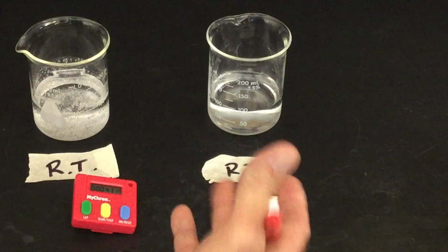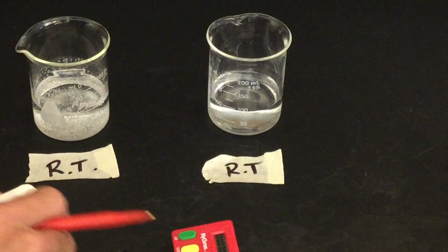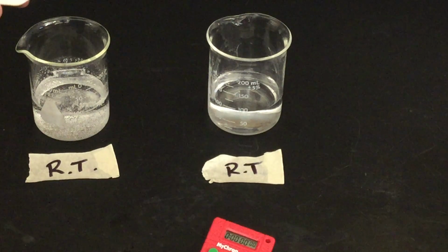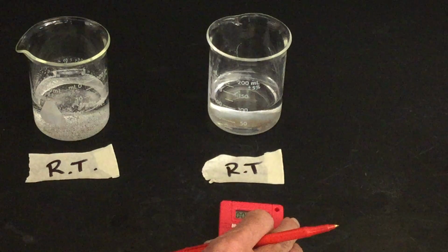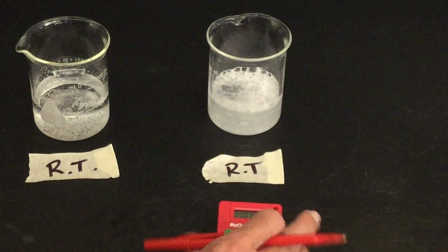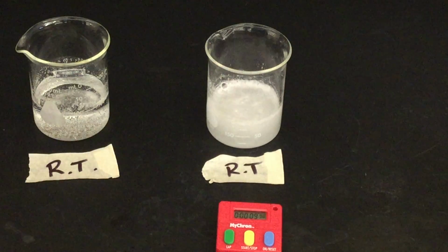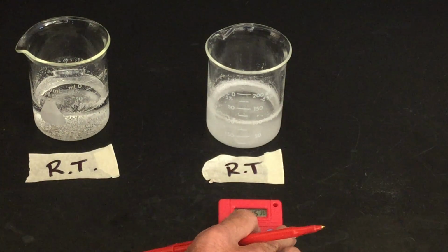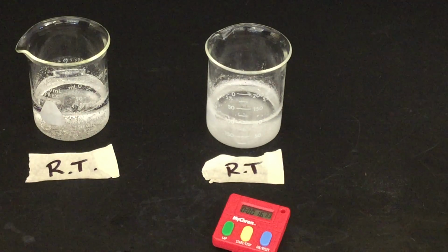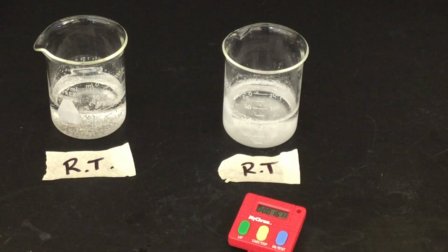Okay, so what's going to happen when this crushed one goes into the water? Is it going to be faster or slower? There are smaller pieces, so there's more surface for them to react with the water. Okay, it's pretty much dissolved. There it goes. So that's about 16 seconds for the crushed one. Faster than the hot. So now we're going to do an analysis of these numbers, and we're going to do some graphing as well.